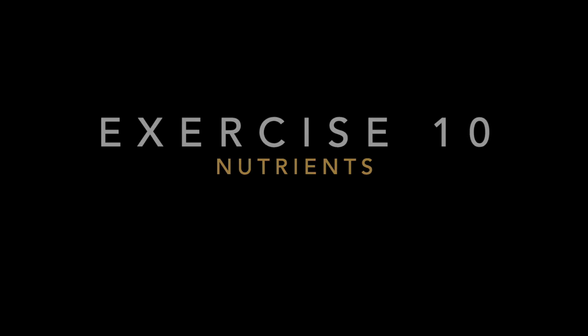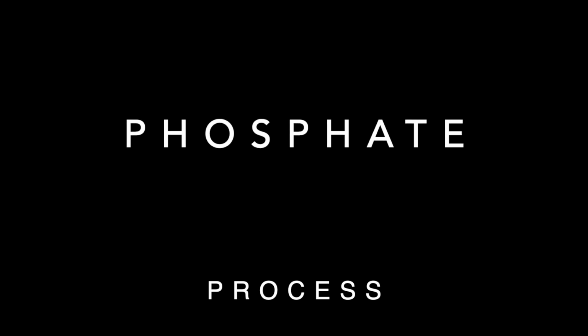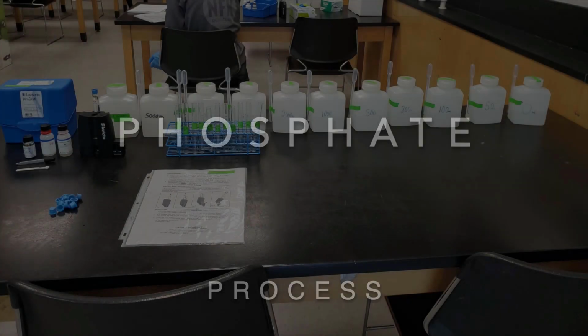Today, we will be looking at how different nutrients change with depth in the water column and between the surface of a river and the open ocean. First, we will look at phosphate, which is an essential nutrient for photosynthesis.